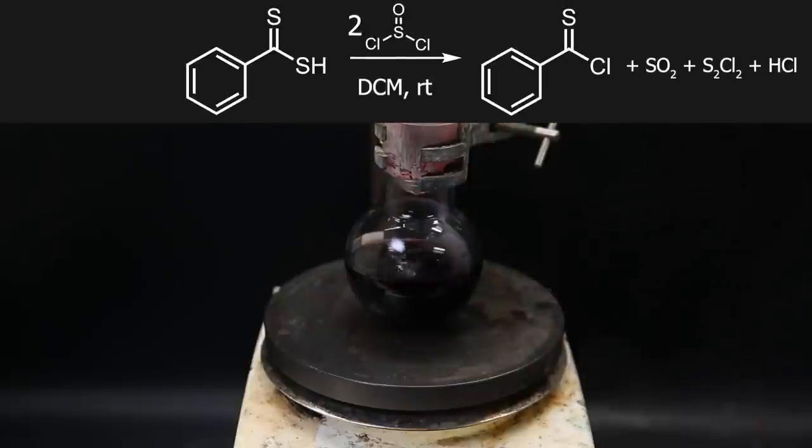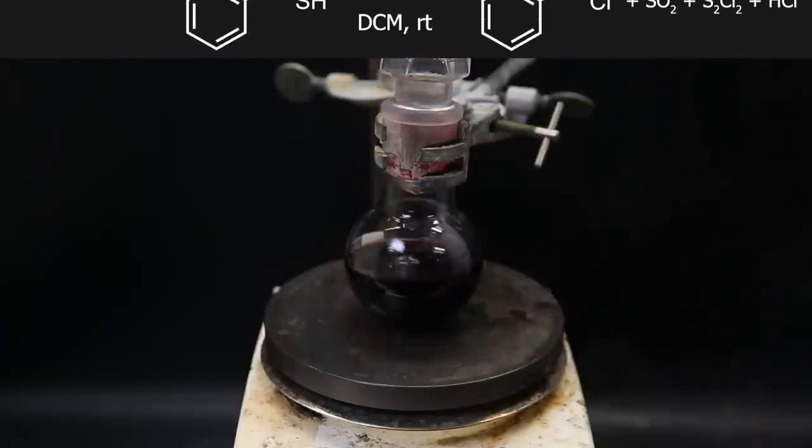In the reaction, two equivalents of thionyl chloride will chlorinate the dithiobenzoic acid, to thiobenzoyl chloride, while also forming sulfur dioxide, disulfur dichloride, and hydrochloric acid. When that is done, it looks pretty much the same, and I set the flask in a heating mantle.